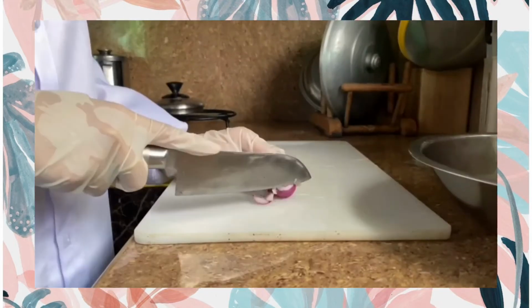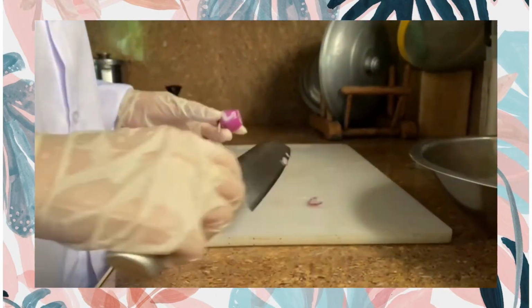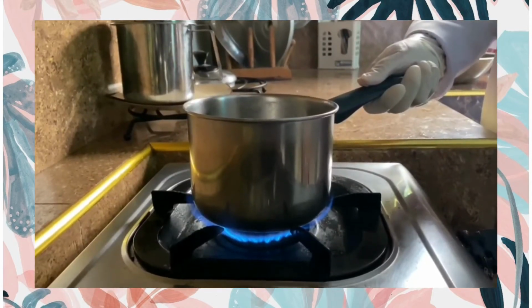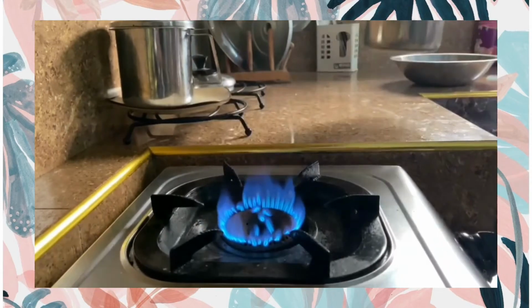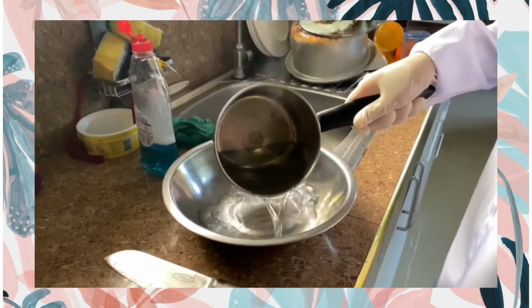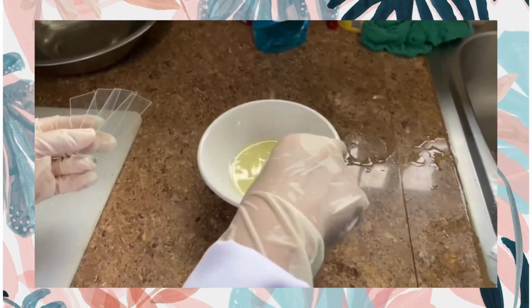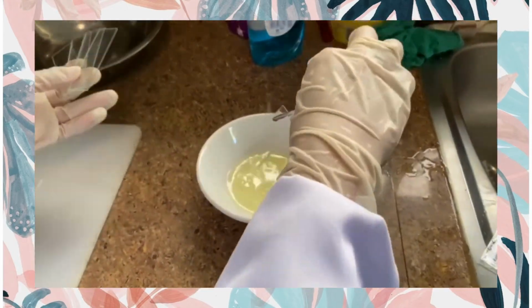First, let's prepare our specimen. Boil water up to 40 to 60 degrees Celsius. Then put the hot water in the basin. Next, coat the slides with egg white for adhesion.